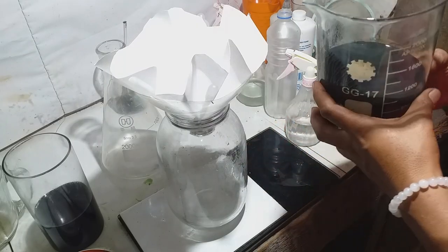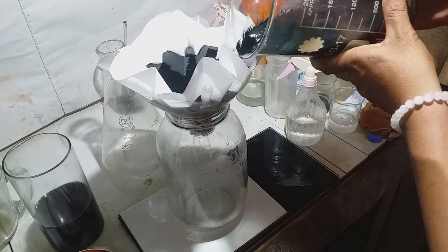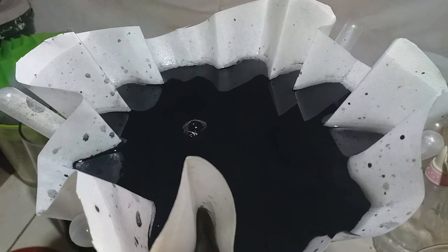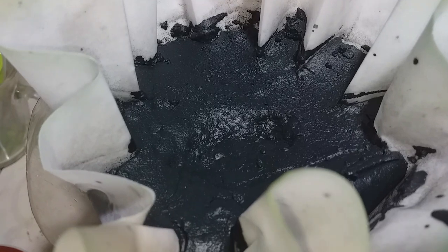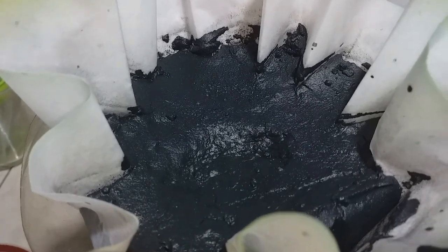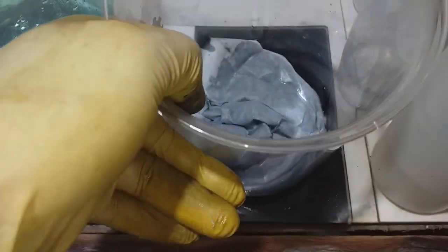Let's begin filtering our precipitation — very dark elements. All black powder is loaded onto our large filter. Clean water passes through. I have already captured all the black sediment, so next we head to a bigger container ready for drying.